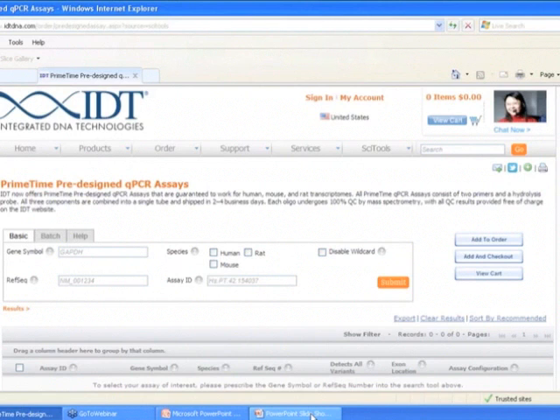I would have to look at a sequence to see specifically what works well. You almost have to look at it in conjunction with the primer, where the primer would be and where the probe would be. Okay, so no surefire recipe. Okay, so it's on an individual basis.